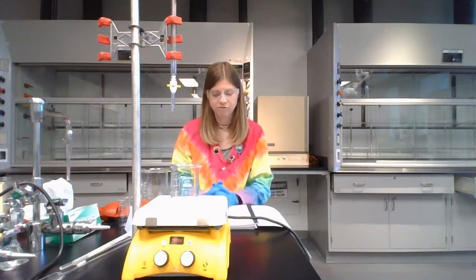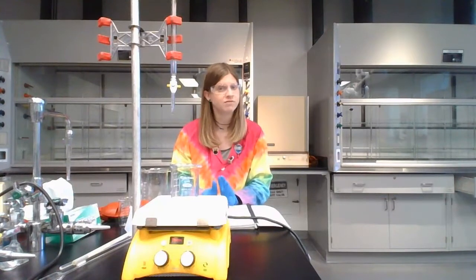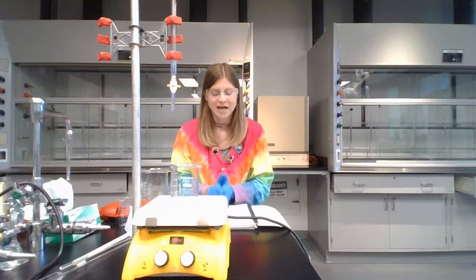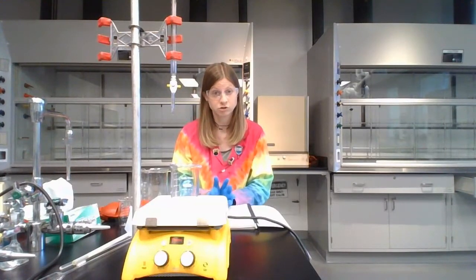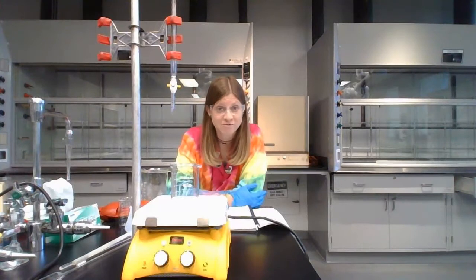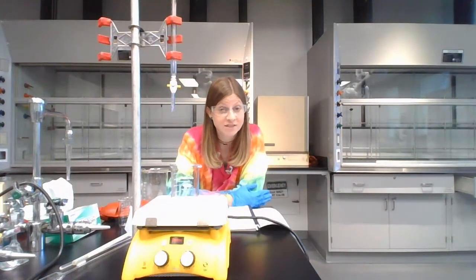So part A for this lab reminds you of the safety concerns and talks you through some of the safety concerns specific to our room and this lab. So potassium permanganate, which is the dark purple solution you'll be using for this lab, is the one that we have to be the most careful with. At any time, you should never have more than 150 milliliters of potassium permanganate. That guarantees that if there's a spill, it will not be more than 150 milliliters.